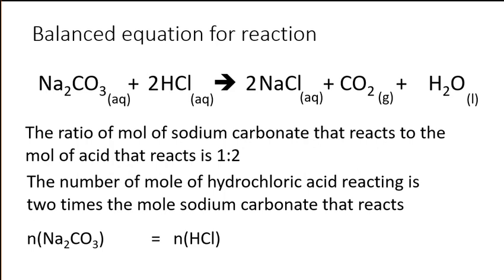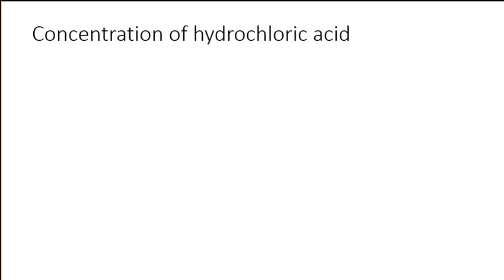So that equation is wrong, but I've just corrected it. It's 2 times the mole of sodium carbonate that gives us the number of mole of HCl.